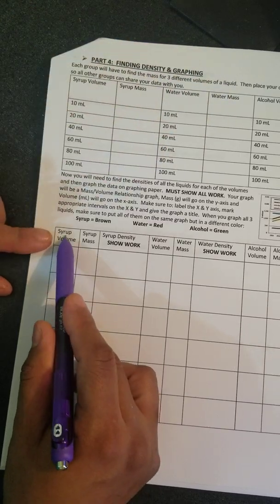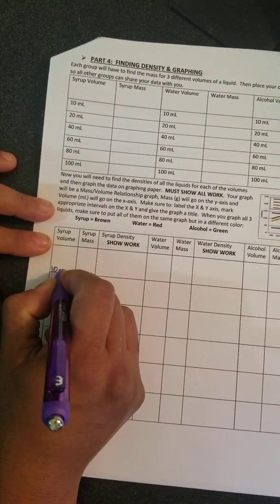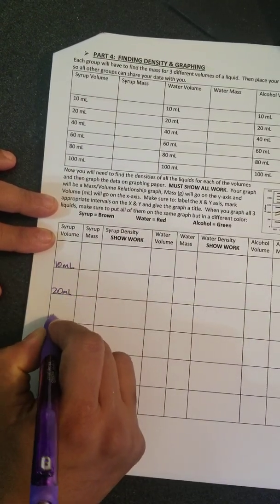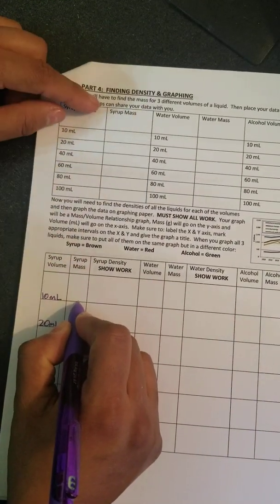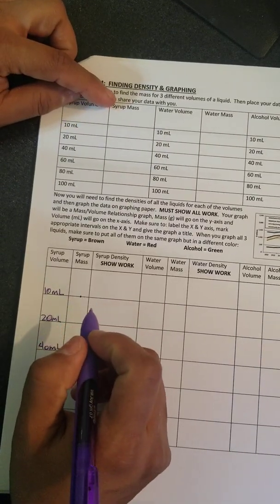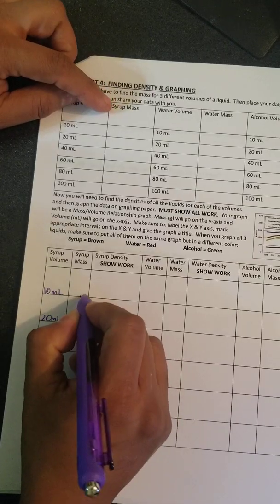Well, we're going to do 10 mLs, 20 mLs, 40 mLs. Where did I get this information? From the chart above. Now, what's the mass? I'm going to do that and video it tomorrow on the scale that I brought home, an electric scale, so that way you can see that, and you're going to write that here in grams.